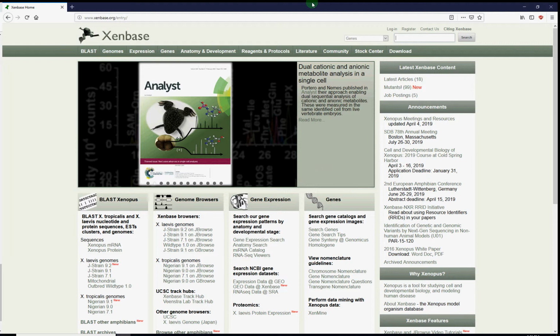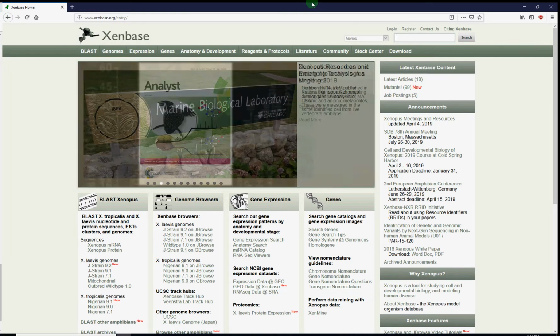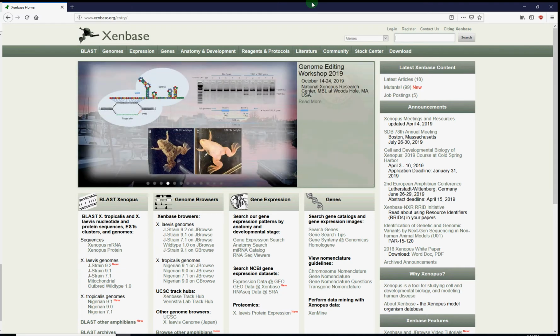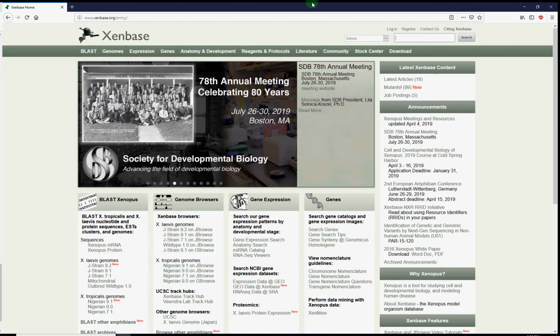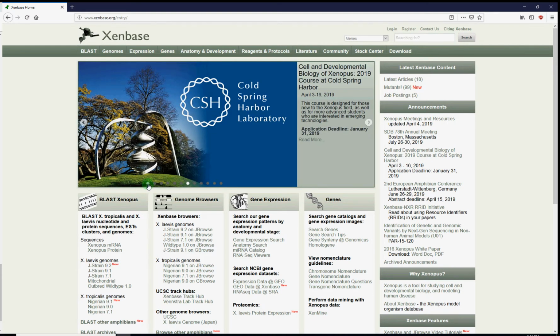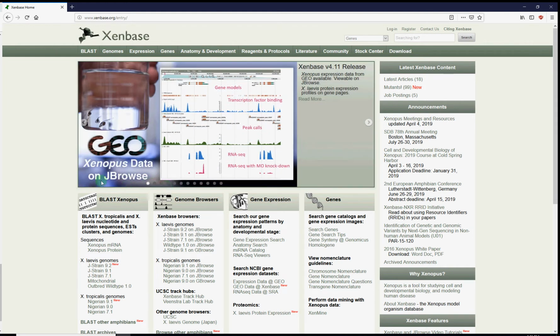This tutorial will explore how to use the new faceted track selector plugin in JBrowse browser. It's a new way to filter tracks for which ones you'd like to select for viewing in the JBrowse browser. And in doing so, I will show you how to use that while exploring the new set of NGS data tracks, the next-gen sequencing data tracks that we've retrieved and imported from the Gene Expression Omnibus database. So that's the GEO database.